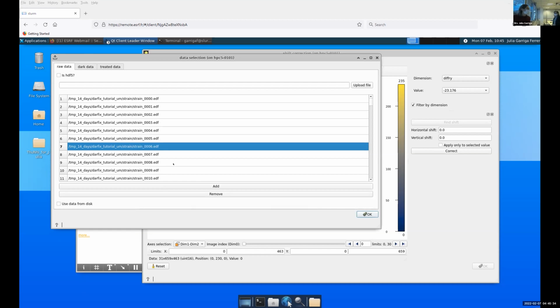But what worries me is that he finds the same thing for his own data, and in his own data he should have more than 2 images. So there are 2 possibilities. Either since they were subscans, there was a velocity problem, and then you only have the first and the last image for each scan at one motor position for diffraction, which is worrisome, or I don't know. So we can check it later if you want. In any case, I will check it after he has updated to the latest version, because this version, I don't know how the filter works, because we updated it, but I think it should work fine. I think your version should work fine, so we will check it out later.